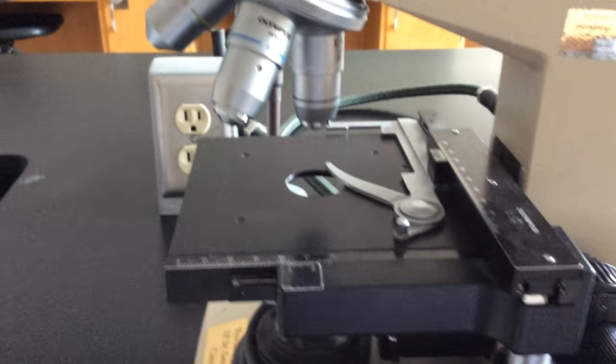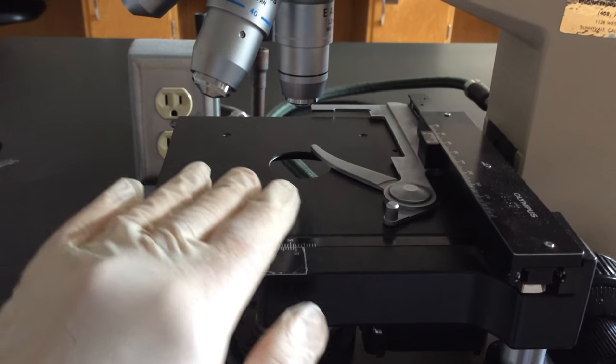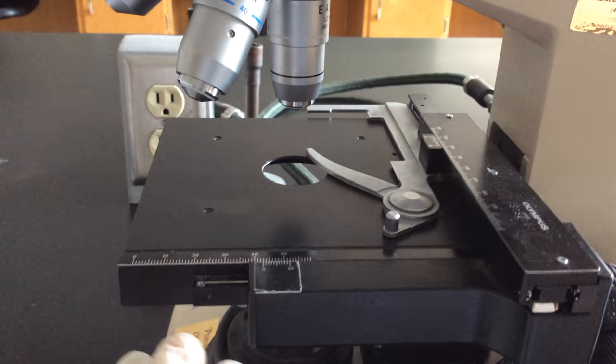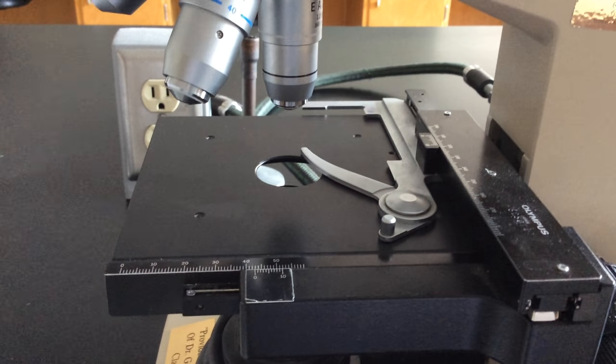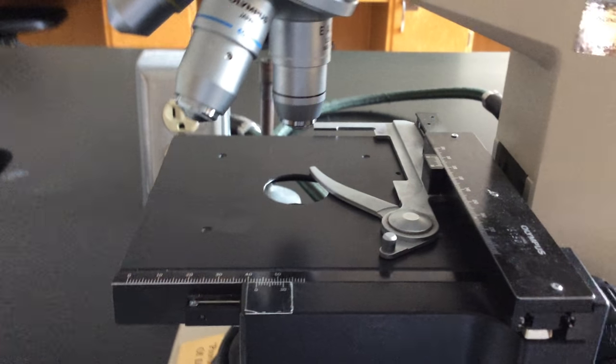If we keep going down here, we see our stage. This is where our microscope slides will be placed. And I think I forgot to get a microscope slide. So let me see if I can pause this and I'll get a slide so we can demonstrate.